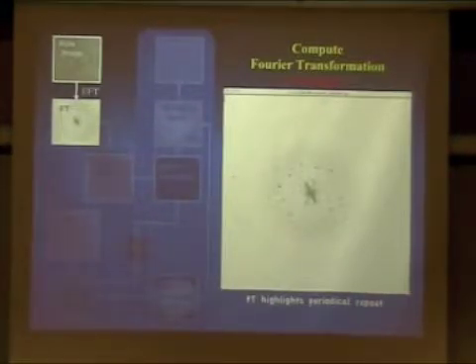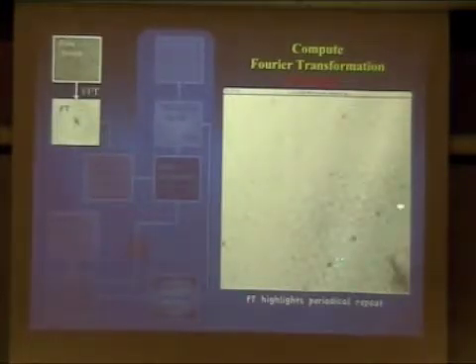Here there are some images. Hopefully it will help you understand what I'm talking about. So for example, now we're just doing a Fourier transform. This is just part of it. Remember, the Fourier transform gives you the same exact information as what you have in real space. So it does not only contain the crystalline information at the spots, but also the noise in the background. So what do we do to make it possible? Now I'm putting it up so you can see the way we're doing the masking.